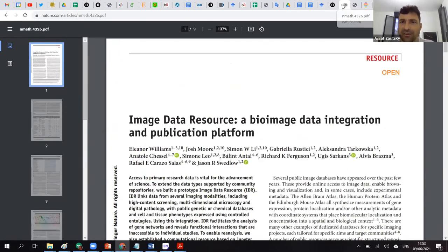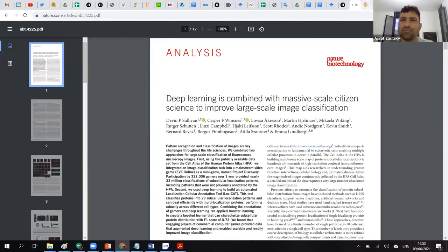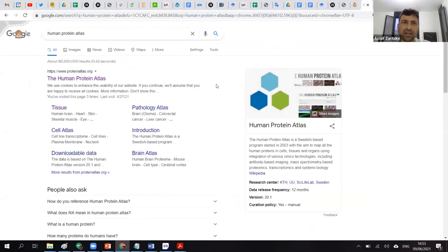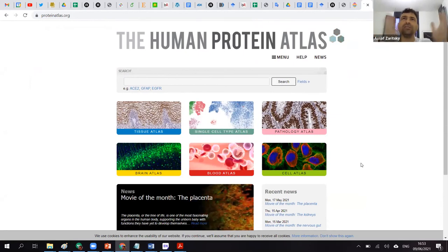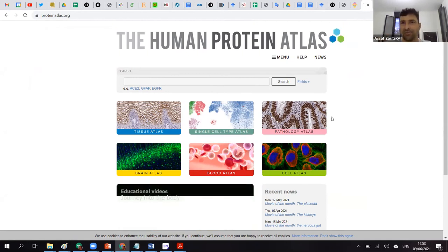And then the second thing that I want to show you, just because it's cool, is the Human Protein Atlas, which is another nice data set. And they also have all kinds of things. One of the things that they have is a localization pattern of a specific protein, and you need to predict it. There was a Kaggle competition about that, that actually drew a lot of attention from computational people, who had to predict which organelles these proteins are localized to.